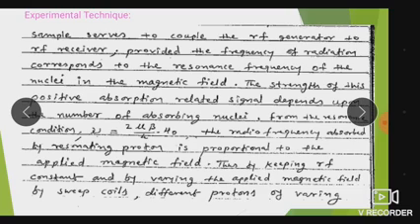So the radio frequency absorbed by the resonating proton is proportional to the applied magnetic field. So the frequency nu is directly proportional to the applied magnetic field.